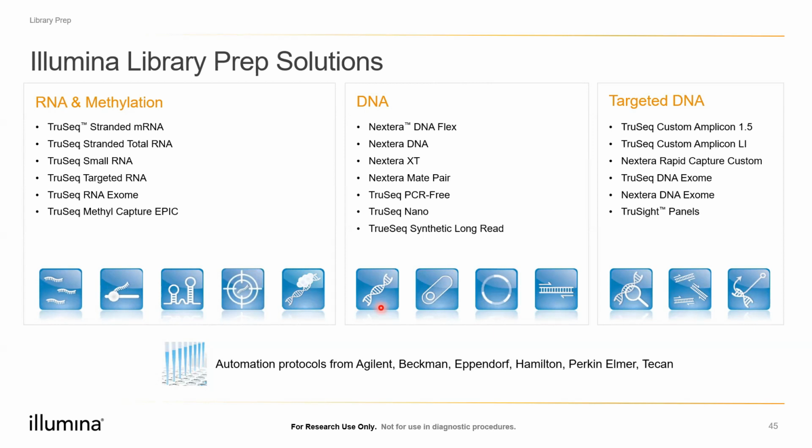Yes, I think the next question is on me. What is all the information we can extract out of RNA-seq? We can get splice site variants, we can get an expression profile, and we can get a differential expression profile. And downstream, of course, pathways can be analyzed, gene ontology studies. So basically it depends on what question we are asking that we'll be doing the downstream analysis. Pathway is one of it. There are multiple ways it can be analyzed. I think Pine Biotech have a plan for you. I think they will be using some tools specifically on this, I believe.